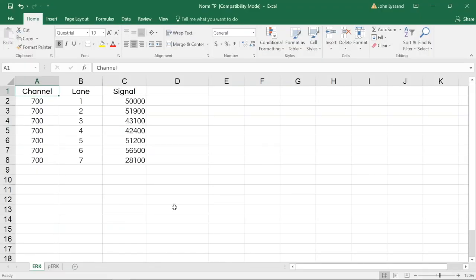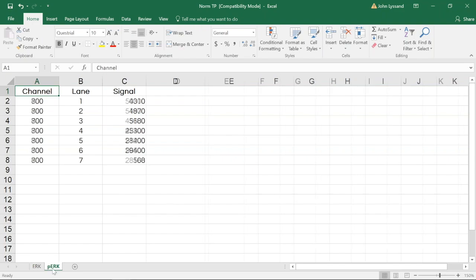In Excel, the quantification from the pan-ERK antibody is placed into one tab, and the quantification from our phospho-ERK into another.